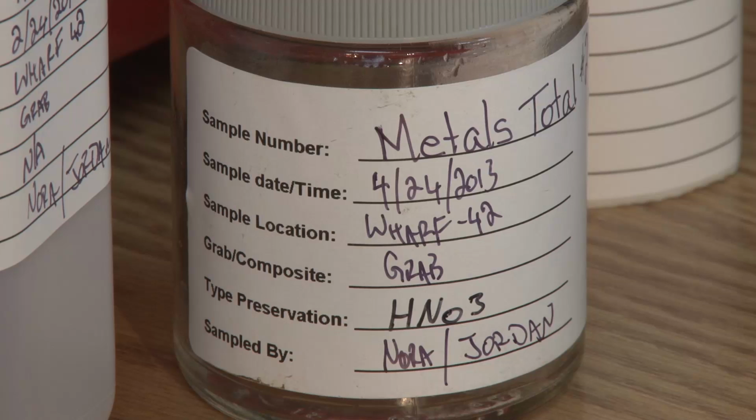Apply a piece of clear, wide tape to protect the label against dirt and liquids after it is completed and placed on the sample container. If a label is mismarked, relabel the sample. Do not write over a mistake.